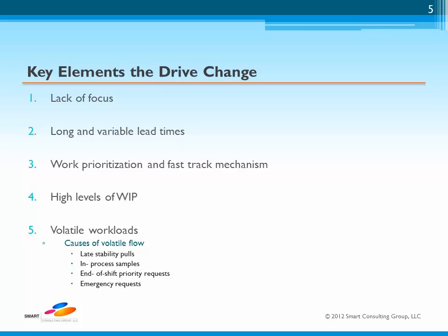Volatile workloads. Because of variability in the supply of samples within the QC laboratory, predicting capacity and requirements is often difficult. This inherent unpredictability frequently causes the problem. Peak moments of sample traffic and high productivity and suboptimal lead time performance are frequently followed by dramatic dips in performance with low productivity. As already mentioned, the key point here is to look at workload stabilization.